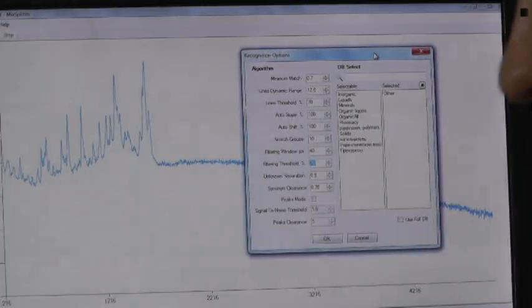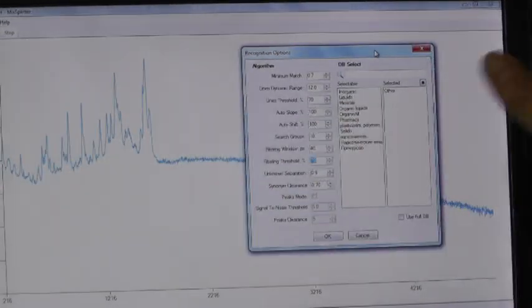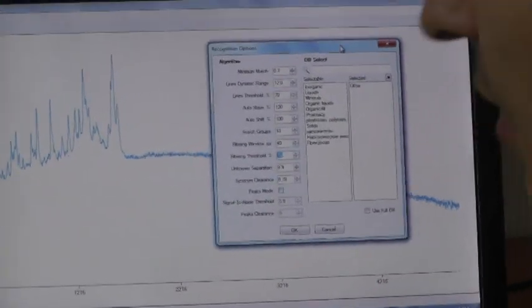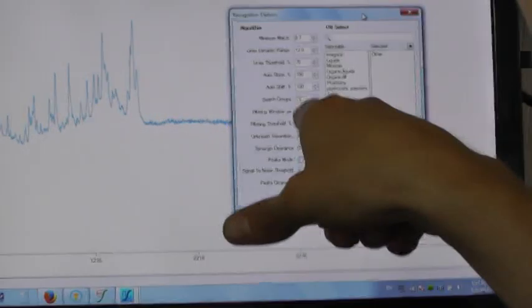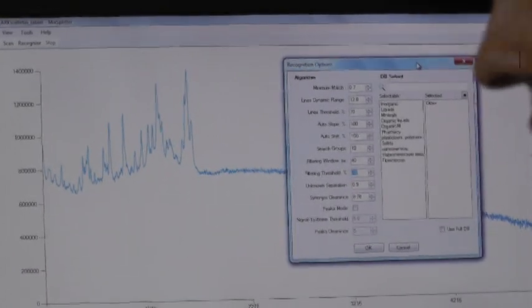They are just empty, taken from empty areas of the sample. They look like background or fluorescent shape, and we don't need to recognize them. We just need to throw them away. And these two parameters are used as a criterion for separating Raman spectra from background.